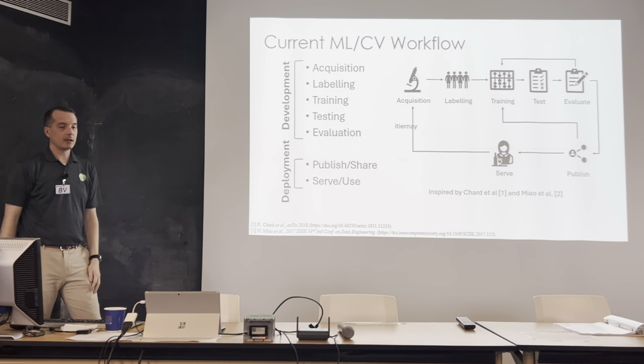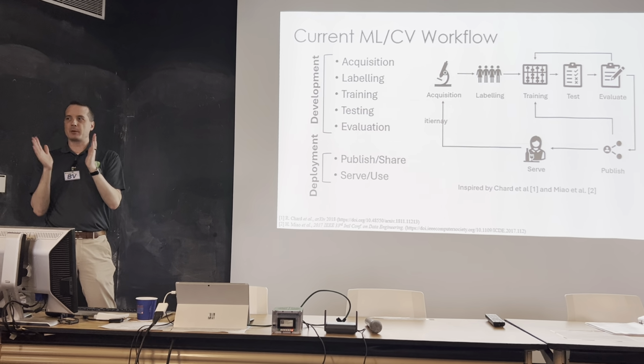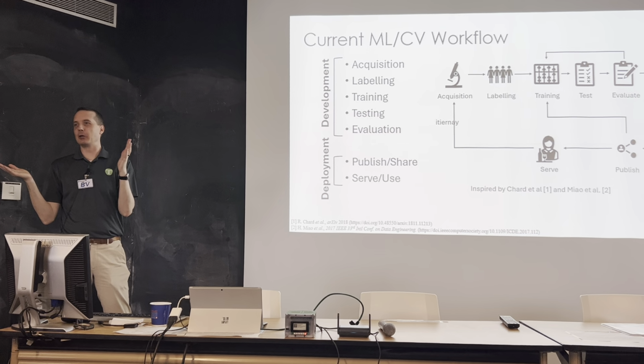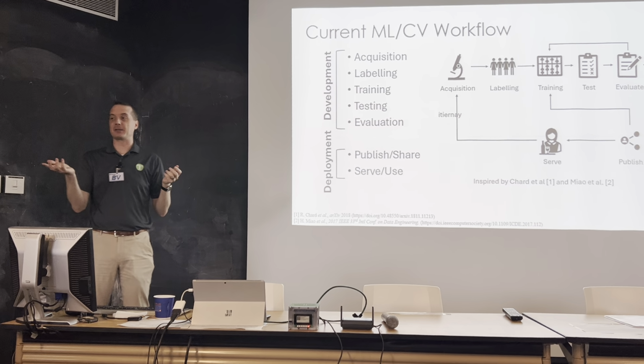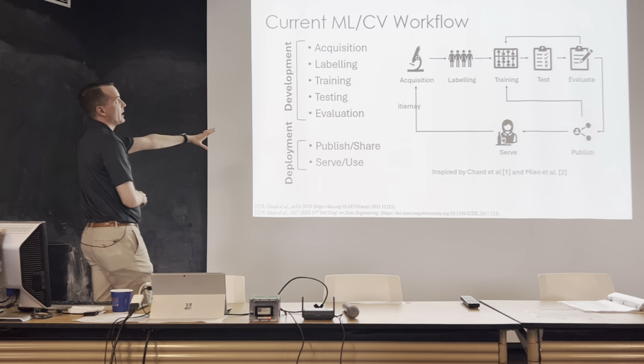All right. So one of the things about the speed is that they go at once per minute because they're like, we're not going to look at those images if we take any more of that. Right? So one of the things that we've been able to do is enable them to collect faster on all those acquisitions.